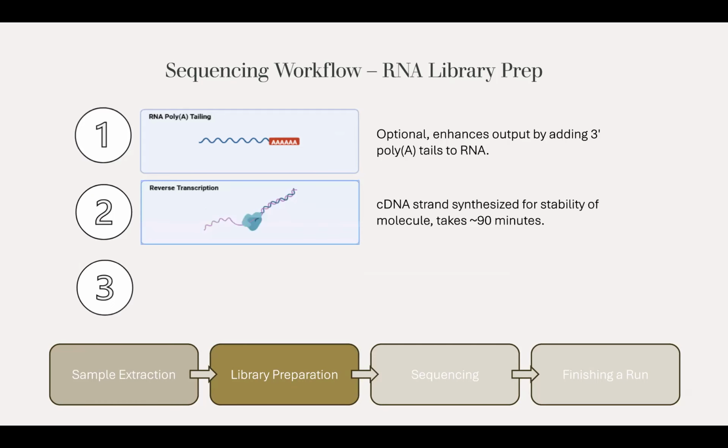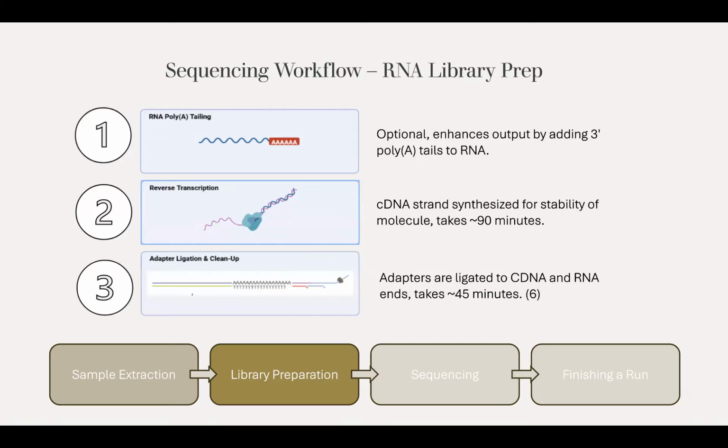Then is the reverse transcription step. Again, this step is included in the protocol. This is where cDNA strands are synthesized for the stability of the molecule throughout the rest of the library prep phase. And then finally, the same thing, adapter ligation and cleanup. So this protocol probably takes a little bit longer. It's a little bit more finicky in my experience, but again, if you're practiced, this should only take you about 2.5 hours, not including the quality control.